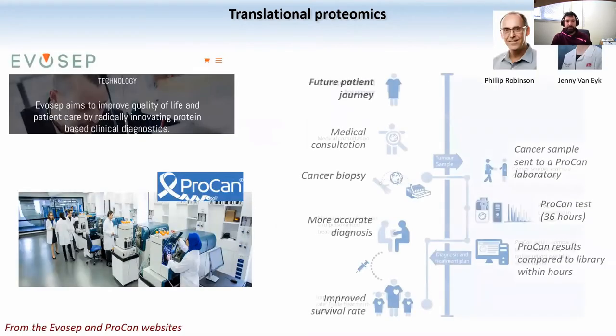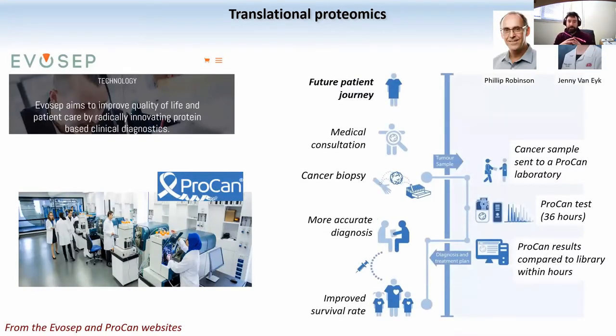And this is an example of real applications where people already now actually use proteomics, for example, to diagnose a specific type of cancer. This is a company that runs in Australia, near Sydney, and this company has, I think, 6 or 12 mass spectrometers now. When they get a biopsy from a patient, they perform proteomics, and then using machine learning, they try to associate it with different types of cancer isotypes that they have.